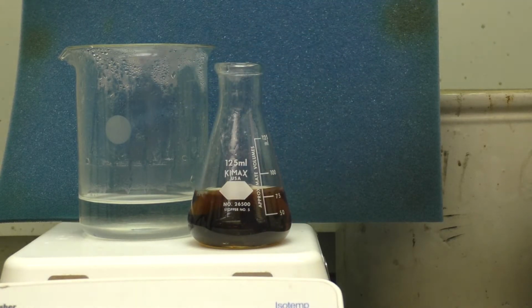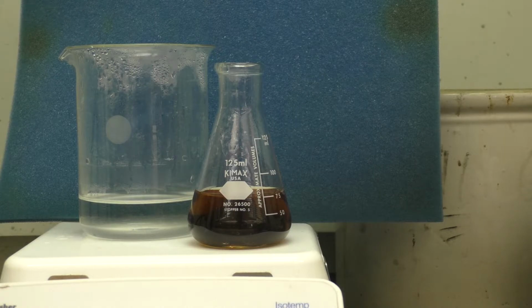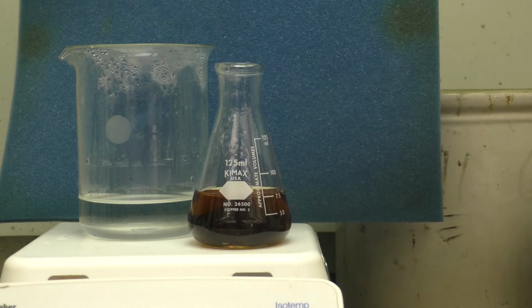I will now add the 2 milliliters of acetic anhydride.